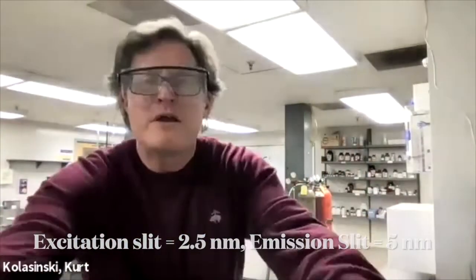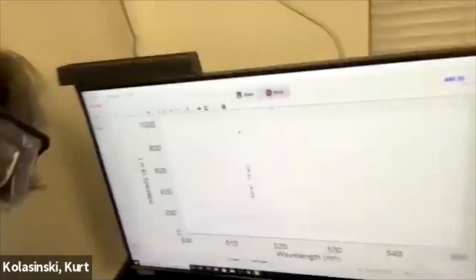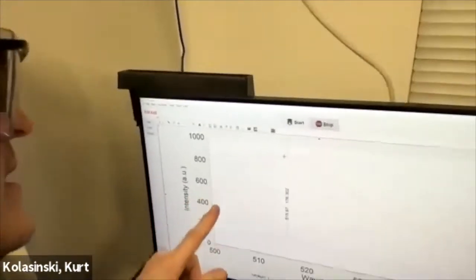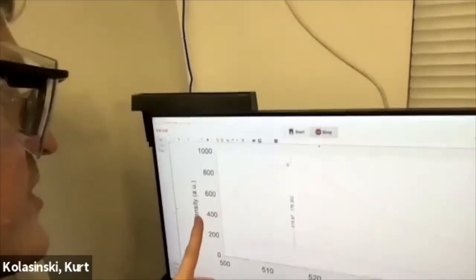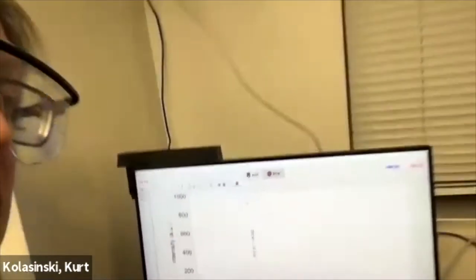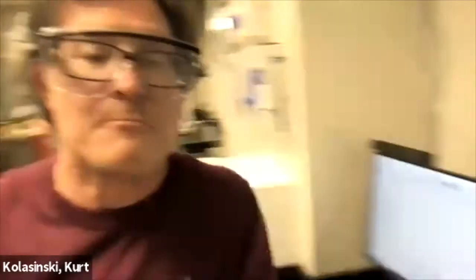And then, where did I start this? Remember, you don't want to see—notice this. You see the peak like this? You never want to get to the excitation out here at 490. You never want to get closer than the sum of those two slit widths.